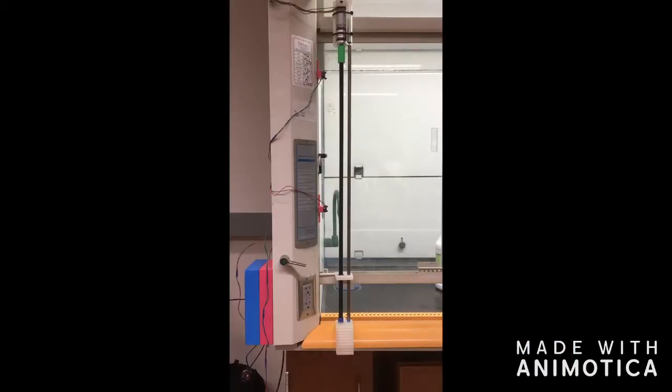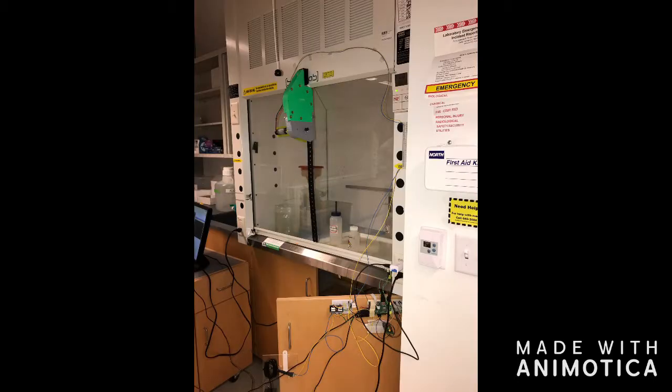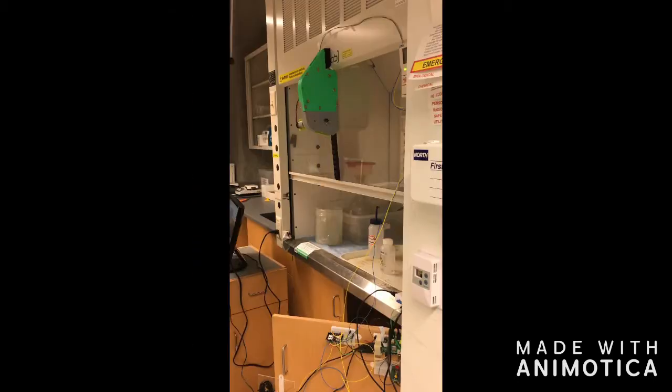Our solution was to build a device which can detect when a fume hood is not being used and automatically close the sash. In addition to this basic function, we wanted our device to be out of the user's way, not compromise the user experience of the fume hood, not be permanently attached, accurately detect users, and be safe to use. Last semester, we designed and tested a device to solve this problem.